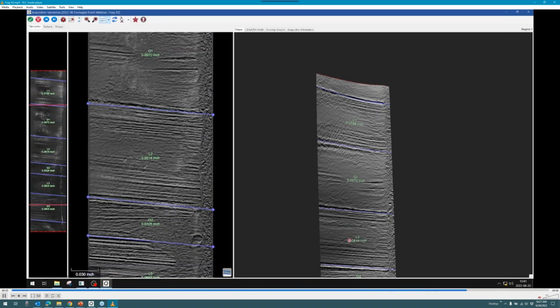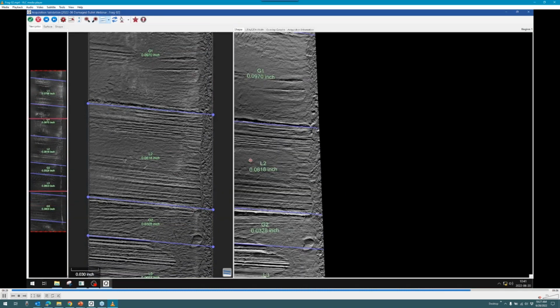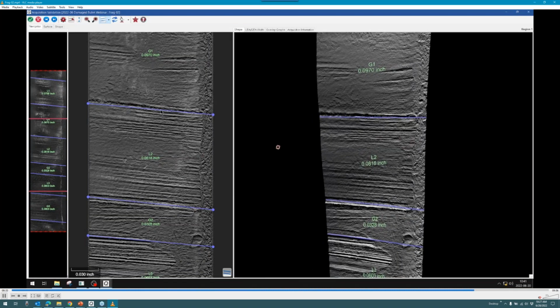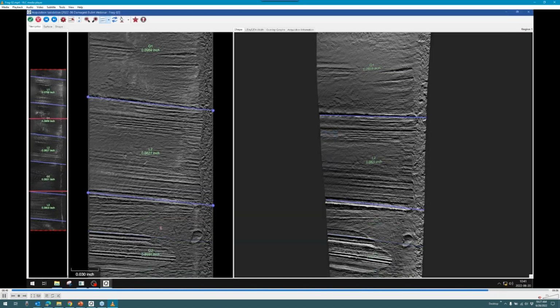And when you're dealing with a deformed surface like this, where the impact has caused the metal to stretch and bend, it's normal that the angle that may be set accurate to your top shoulder could be different than the angle that is still accurately set at your bottom shoulder. You may end up with a fan pattern. You may end up with different angles at your driving shoulder and trailing shoulder because of the impact that took place. This is where it gets interesting.